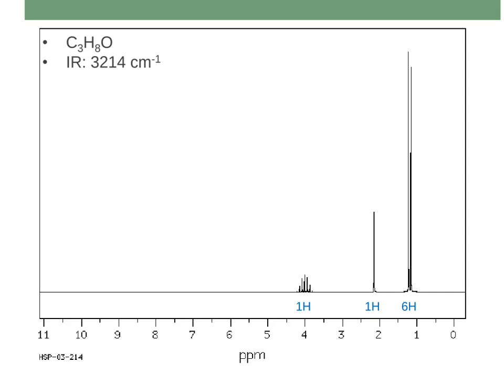I have the formula for you. I didn't give you a full IR, but I gave you an important peak from the IR. You should be able to look at this, 3,200-ish, and think, well, that's above 3,000, so that's probably an OH. It's a little on the low end for an OH, but it's probably an OH. So my molecule has an OH in it, and it's C3H8O. And there's really only two possible products for this. So why don't you take a sec, draw those two products, and see if you can decide based on this spectrum which of those two products it is.